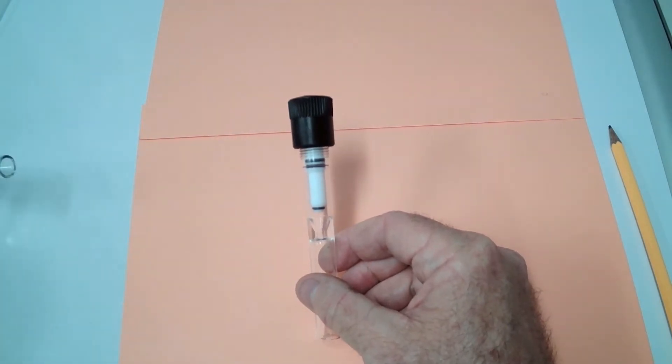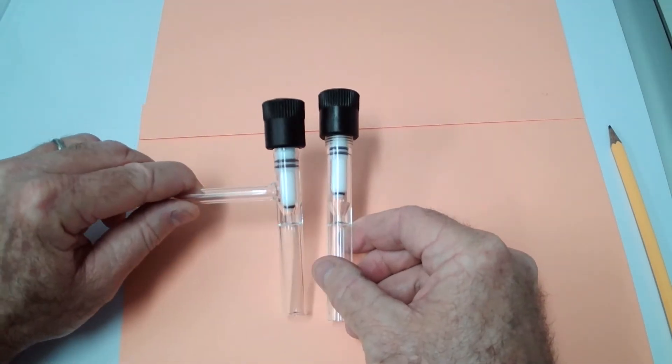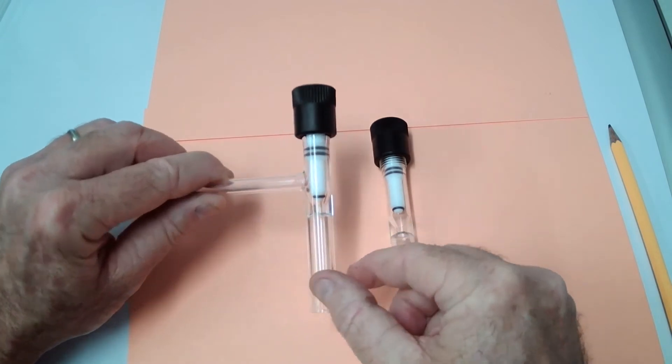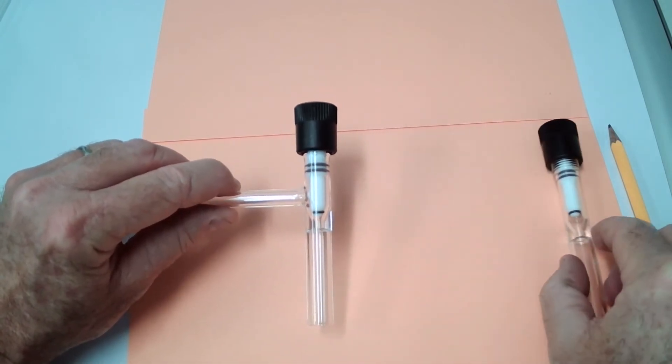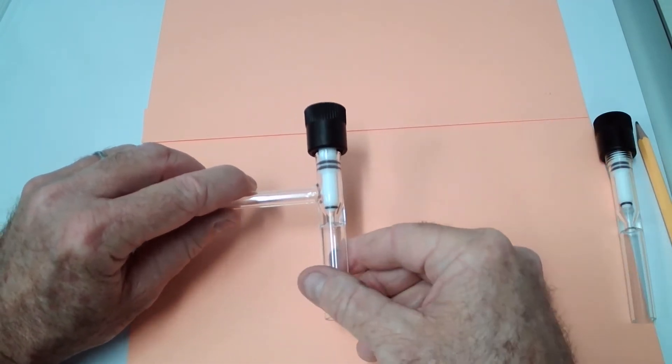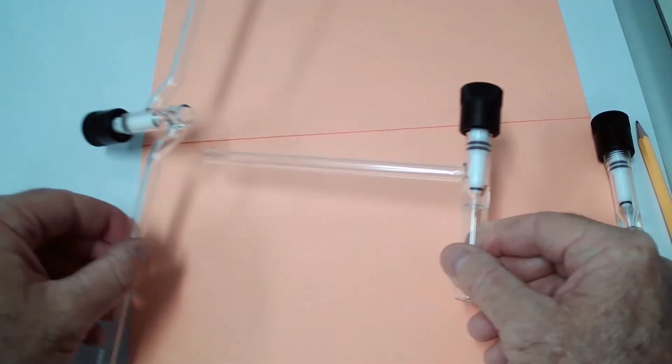They seal arms onto the valves for use in the laboratory, and there are different orientations that they use.